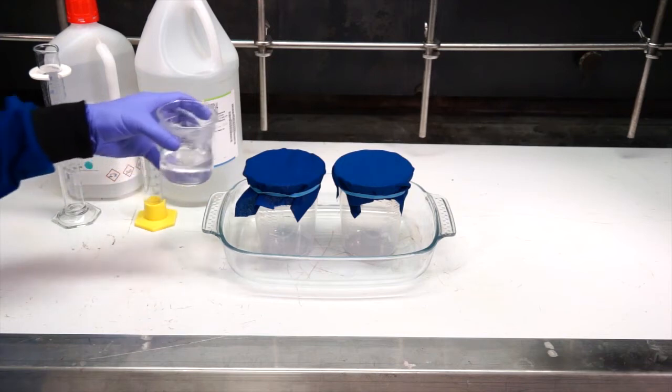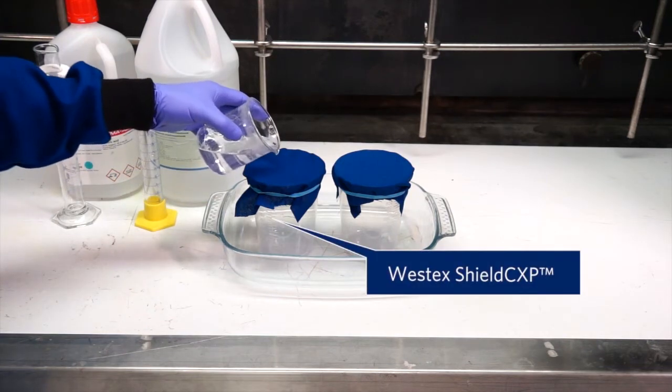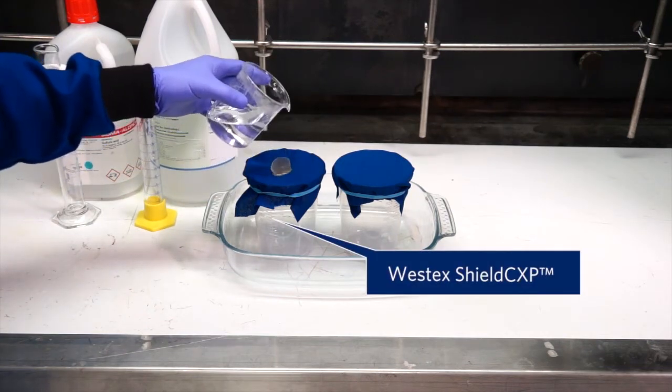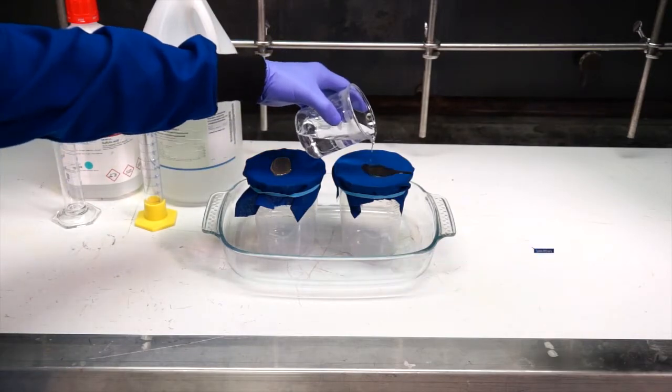But it's used as a common laboratory solvent. When you pour this onto the Westec Shield CXP fabric, it resists penetration by this mixture.